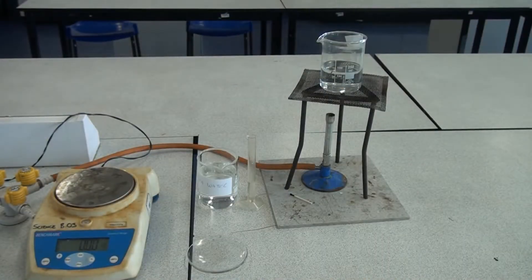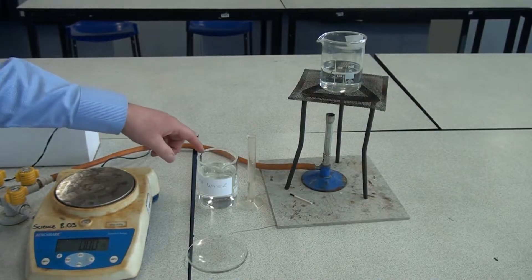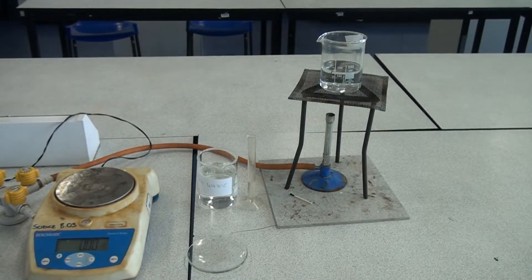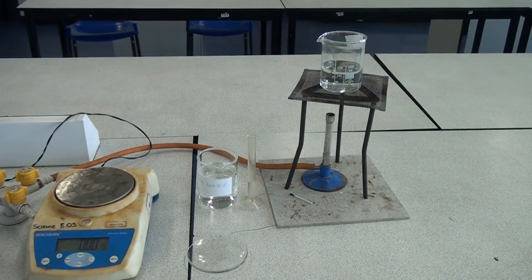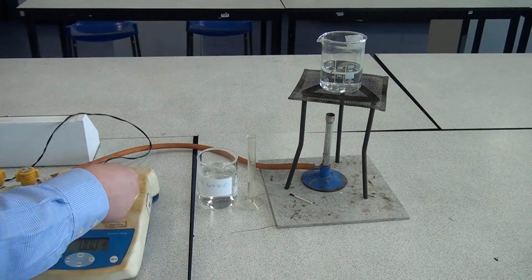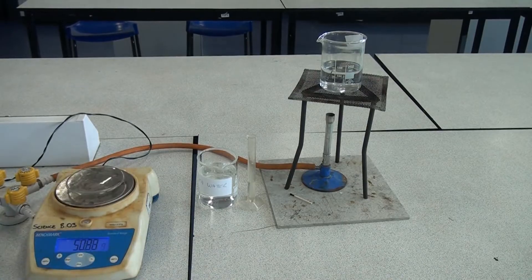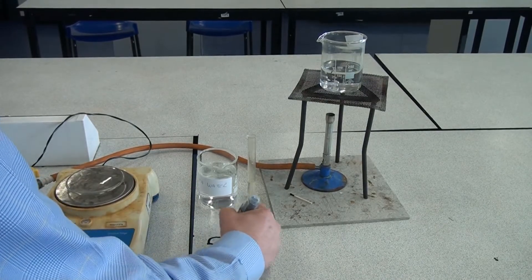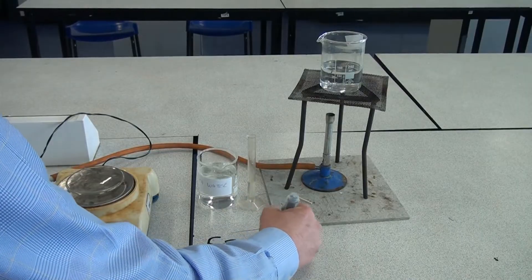To find out how much dissolved substances are in the seawater, I'm going to evaporate the water and see how much dissolved salts are left behind. So the first thing I'm going to do is find the mass of this watch glass and I'll write the mass down: 50.93 grams.